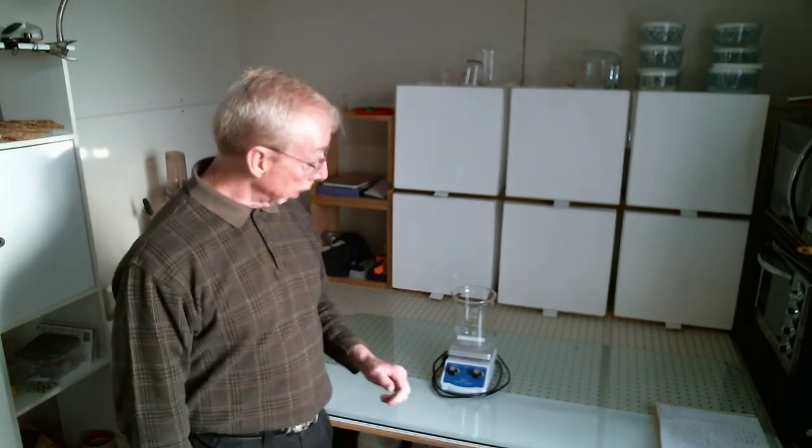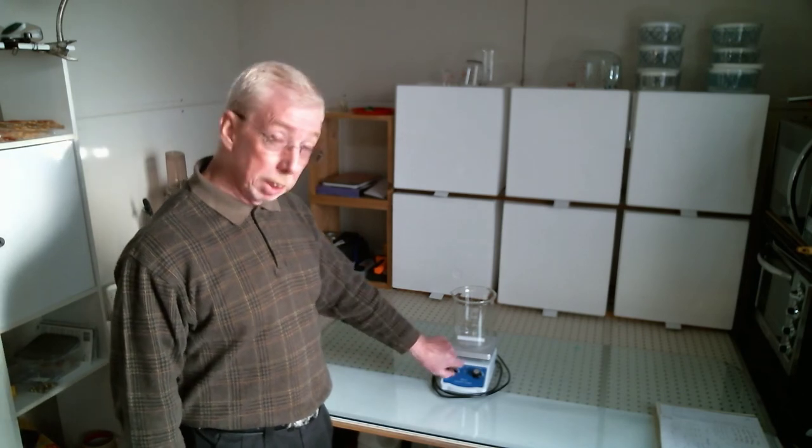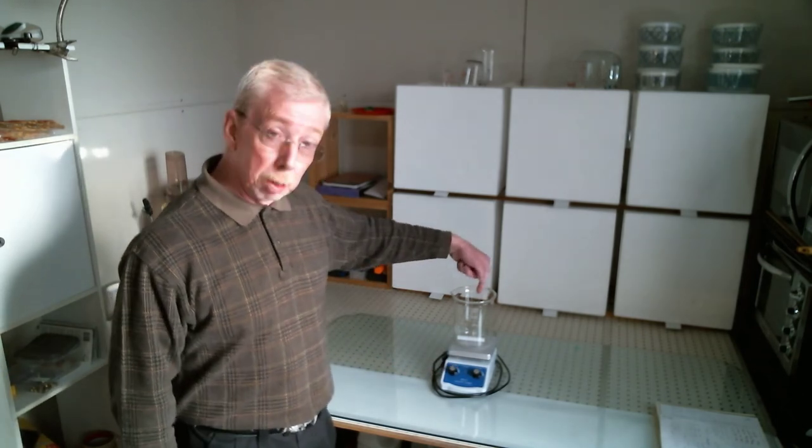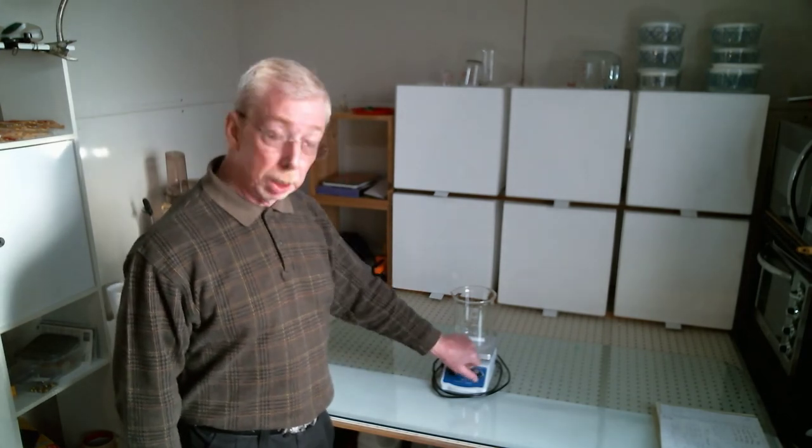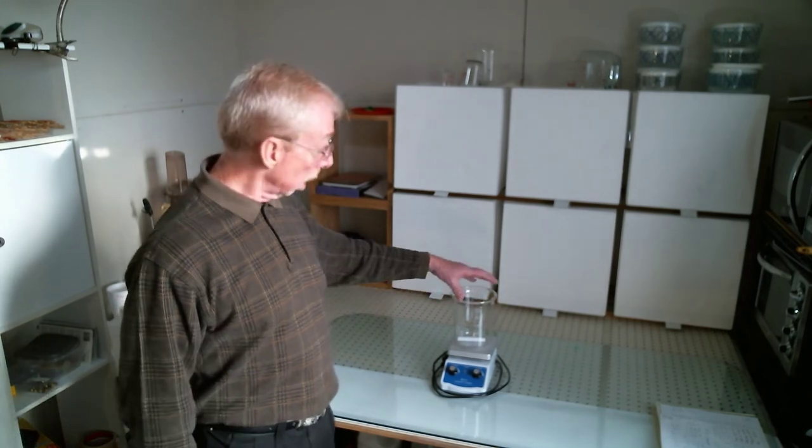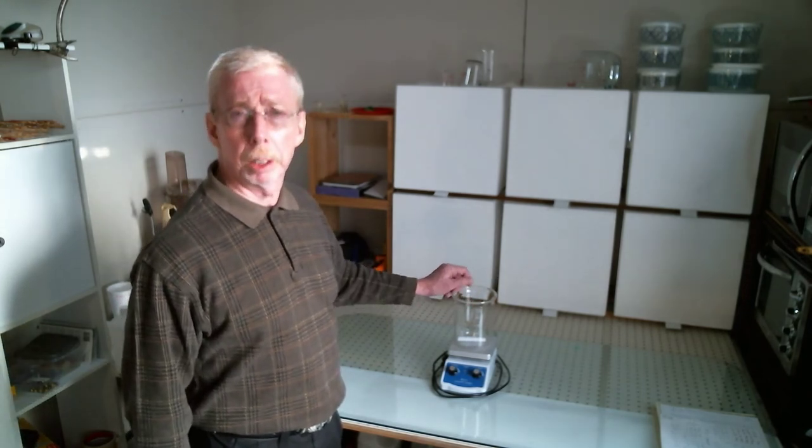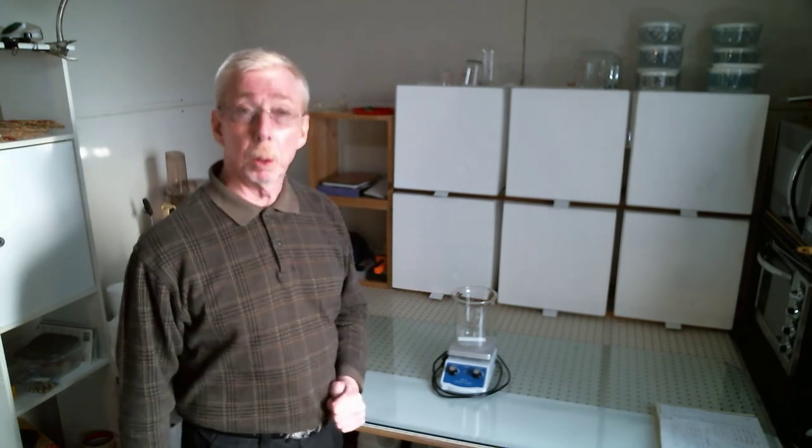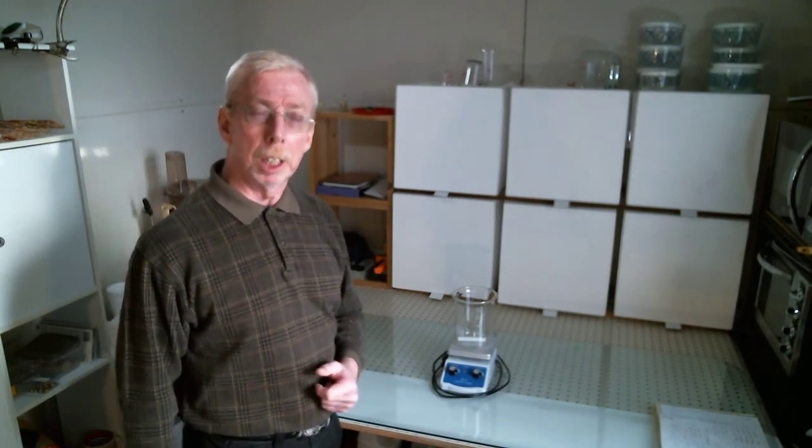What you see right here is a magnetic stirring hot plate. This button is to stir a little iron bar in here - this is a teflon coated iron bar. This is for heat. This is a borosilicate glass beaker, a lot of people just call this labware pyrex labware, and the stir bar. This is enough to get you started on many different projects, not just bioplastics but other things that you may see that you want to try on YouTube.